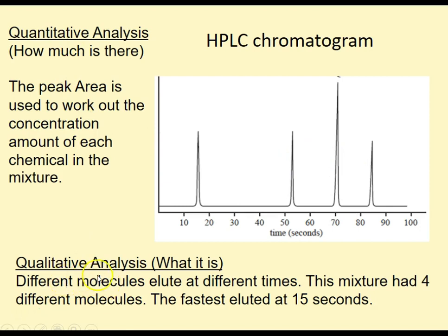Qualitative analysis, what it is, with this axis. So the time will tell you what it is. So if we look at a standard, if we have put some chemical through, some molecule that we know what it is, through here and it comes out at 15 seconds, and then we put a mixture through where we don't know what sort of chemicals we've got, and we get one that comes out at 15 seconds, then you could say that that chemical is the standard that you knew of before.